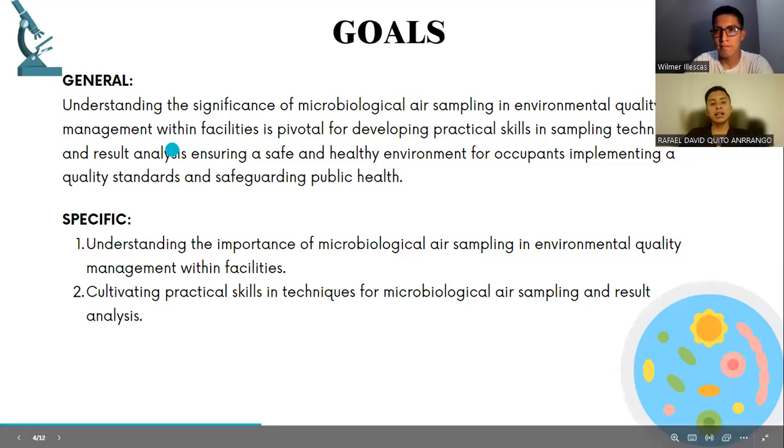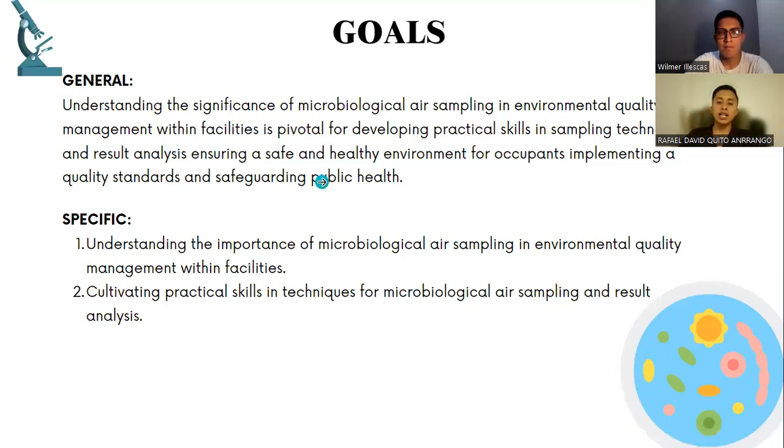Our general goal is understanding the significance of microbiological air sampling in environmental quality management within facilities, and developing practical skills in sampling techniques and result analysis, ensuring a safe and healthy environment for occupants, implementing quality standards and safeguarding public health.